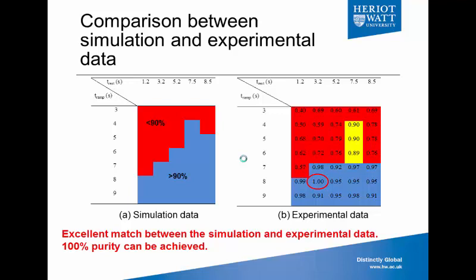Of course, the simulation program is binary, good or bad, but we need to do the experiments to be able to have a better understanding or better analysis of the sorting, depending on the different parameters of the ramping time and the resting time.